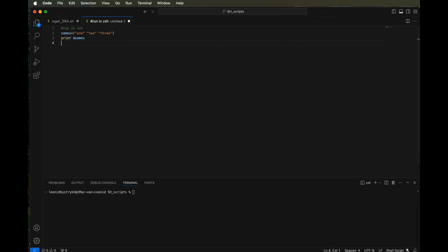Or you do a loop, and knowing how loops are made is also important. The elementary one is a for loop. Do not forget dollar. Then do opens the line. It's also helpful that Visual Studio Code gives different colors to different elements.